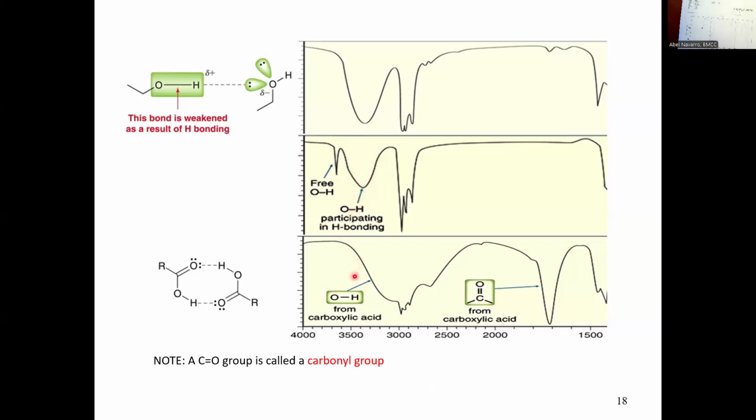Okay. Carboxylic acids, that's the OH that I wanted to discuss. Carboxylic acids also have OHs, right? Let me see my reference table right here. You look at this one, carboxylic acids, they also have OHs. OHs will be visible also in the IR, but they get distorted.